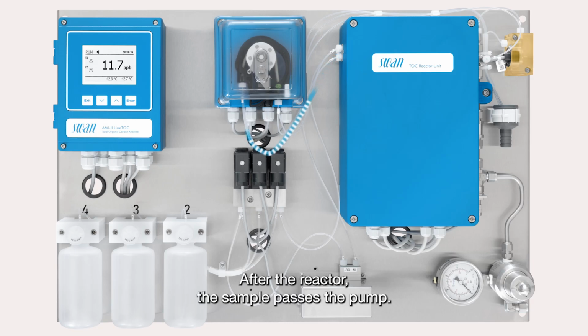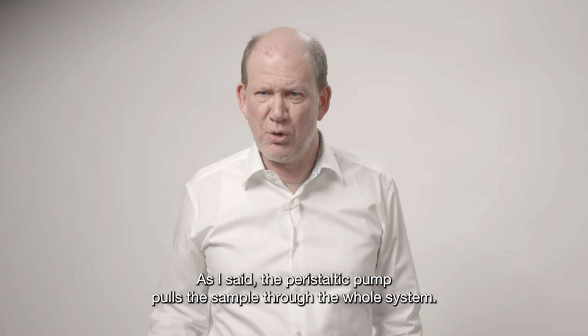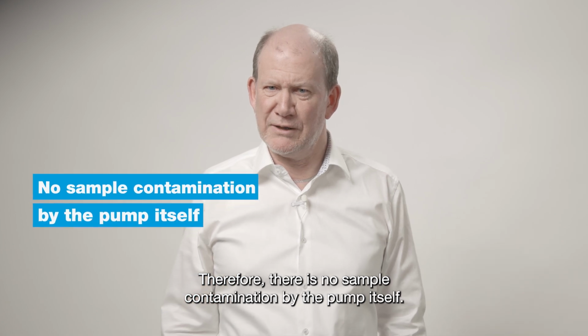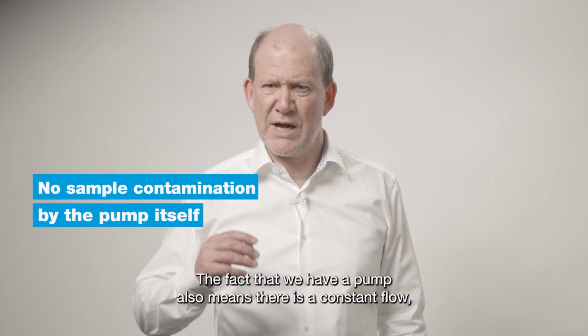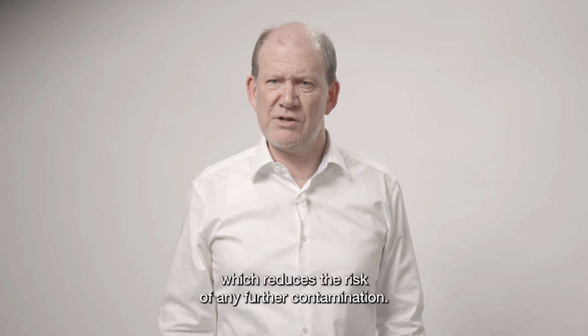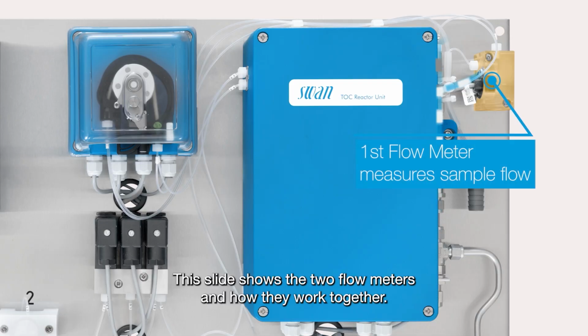After the reactor, the sample passes the pump. As I said, the peristaltic pump pulls the sample through the whole system. Therefore, there is no sample contamination by the pump itself. The fact that we have a pump also means there is a constant flow, which reduces the risk of any further contamination. This slide shows the two flow meters and how they work together.